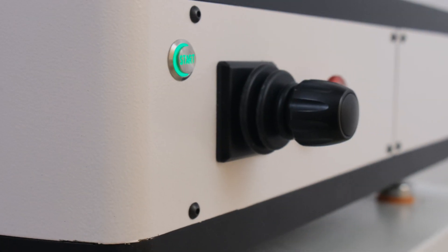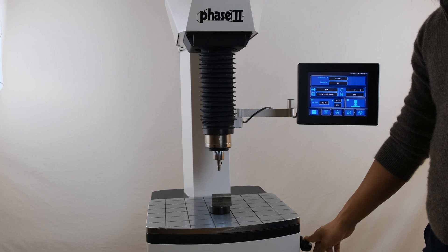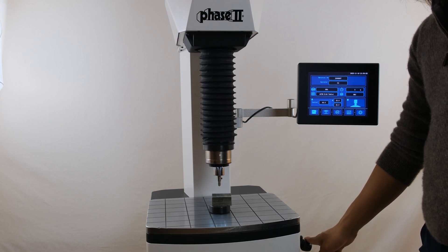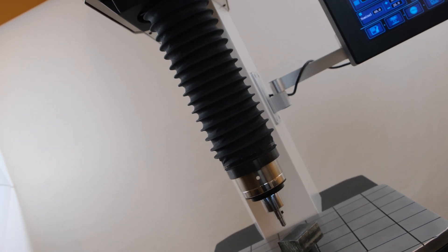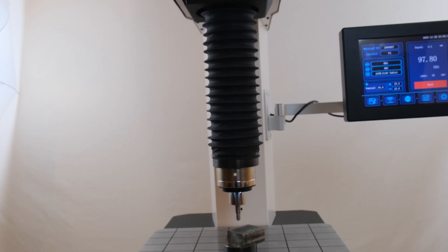This replaces the older weight loaded system where the testing performance is not as consistent or accurate compared to the current load cell system. The automatic Z-axis allows for a single button push test without any operator influence, reducing user error during tests.